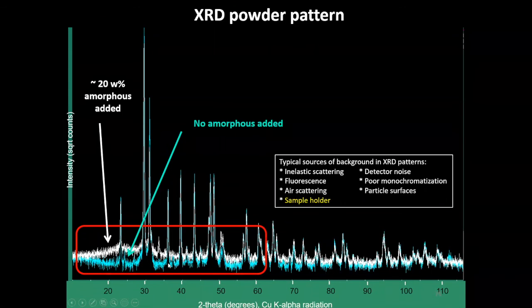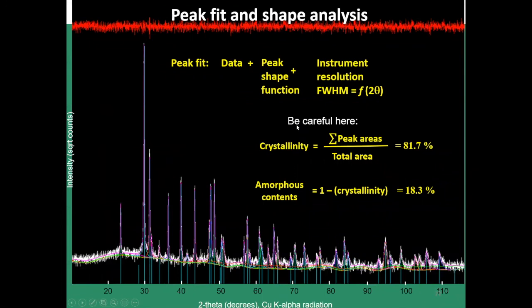So what you want to do next, typically people want to find out the phases. They do a peak search, a peak fit to try to mark the peaks. They run against a materials database to identify what it is.